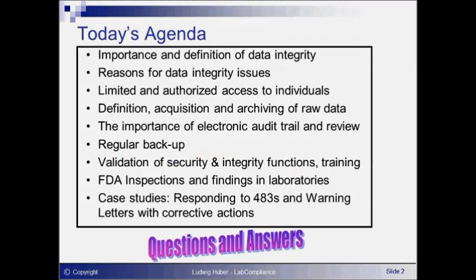This shows an overview of the presentation. I will start by talking about the importance and definition of data integrity, and I will also emphasize the importance of data integrity to ensure product quality and safety of consumers of the medicines. I will then go step by step through key FDA requirements and give recommendations for implementation. They include limited and authorized access to systems, to data, and to operational functions, for example, but many more.